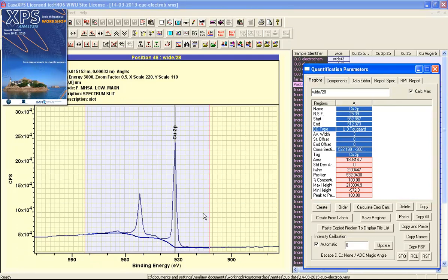The maximum intensity is then calculated using a quadratic fitted to these data. You tend to find more precision when you have noise in the data that might influence the position of the peak if you tick the box here. Otherwise, you will obtain precisely the peak position at one of the data bins.